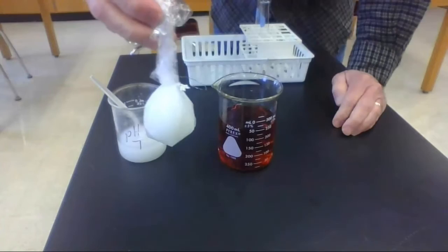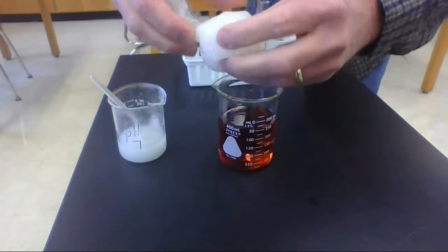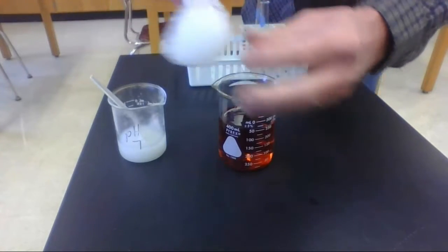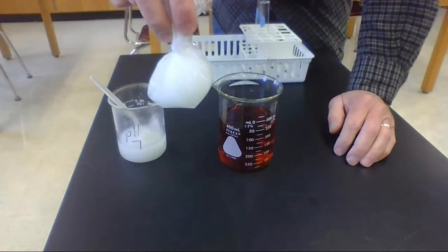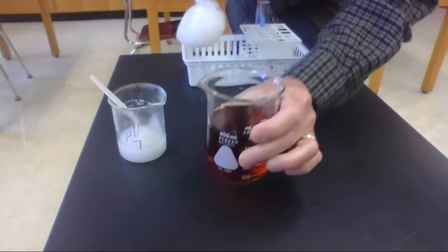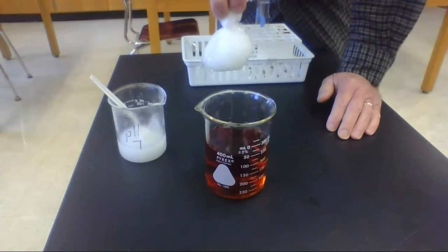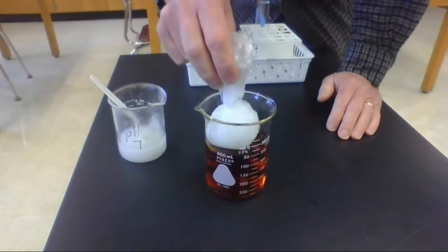So now the baggie, I tied it off so that it doesn't leak, and we've got a starch solution in the baggie. And I'm going to put this model of the cell into a solution here. And if you'll notice, it's got a bit of an orangish color to it, because this is water with iodine added to it.